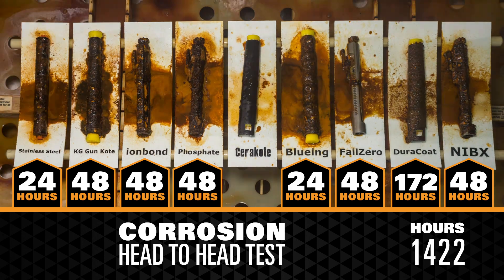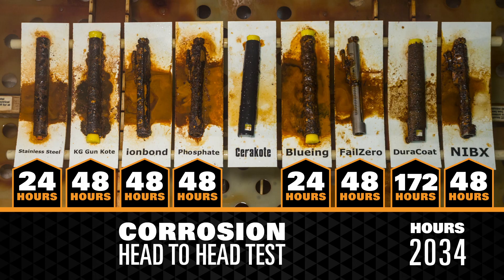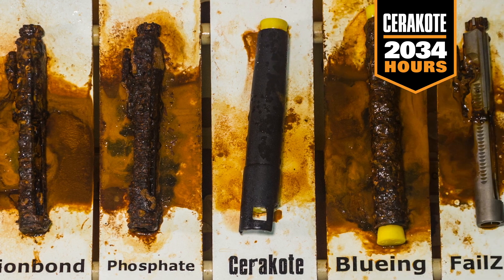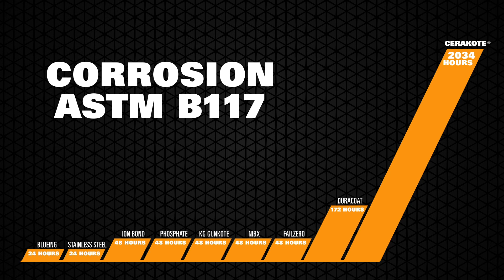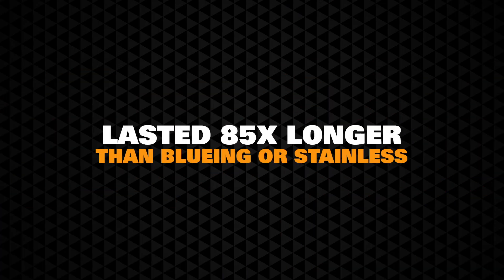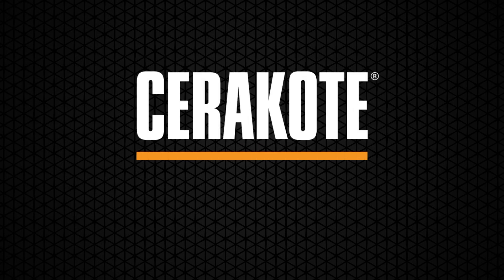We can now easily see which protective finish outlasts all the others. Testing was concluded at 2034 hours when Cerakote showed initial signs of corrosion. Corrosion protection results are easily presented in a simple bar graph displaying the protective finishes on one axis and time in hours on the other. Per ASTM testing standard B117-03, Cerakote finished strong by lasting over 11 times as long as the nearest competitive finish and 85 times longer than standard bluing or stainless steel. See how Cerakote finishes strong at Cerakote.com.